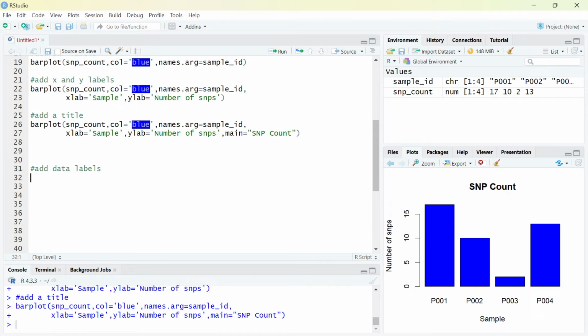First, we need to correct for the range of values that are displayed or plotted. So we need to set a range for the display of these values, the X and Y values. So we need to give a range. So we will need to work on that first, and then we can continue.